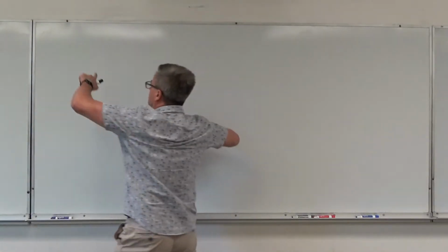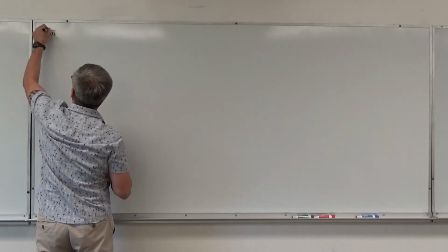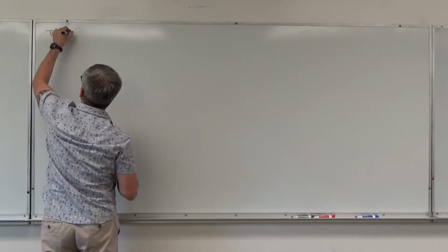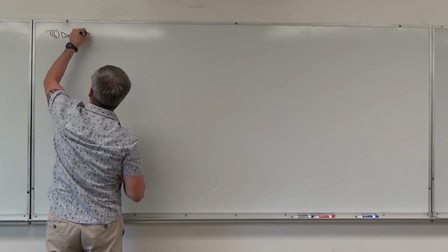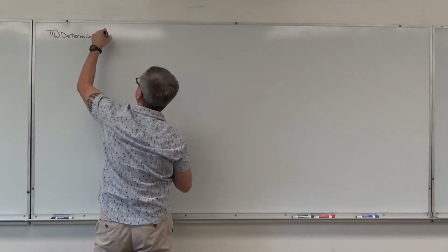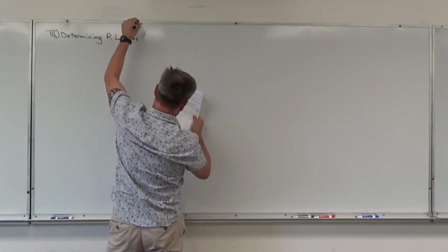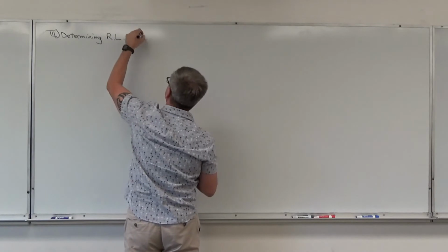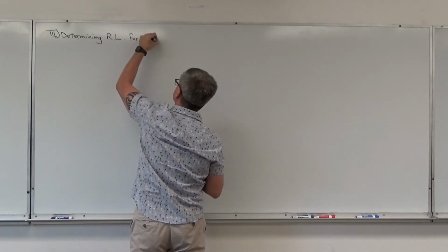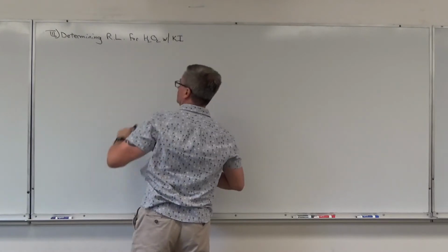So today, determining the rate law for the reaction of hydrogen peroxide with potassium iodide.